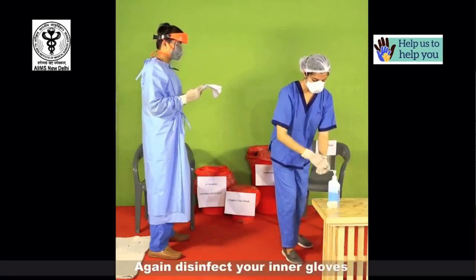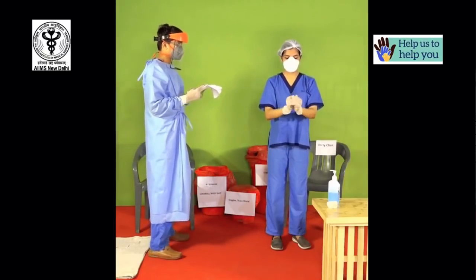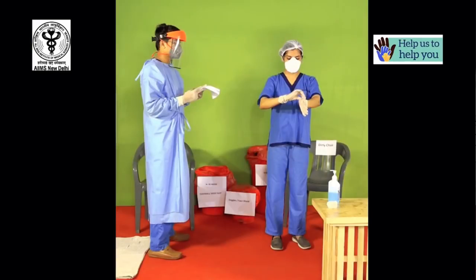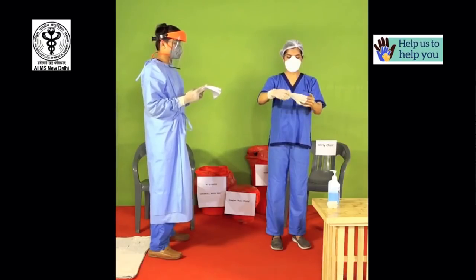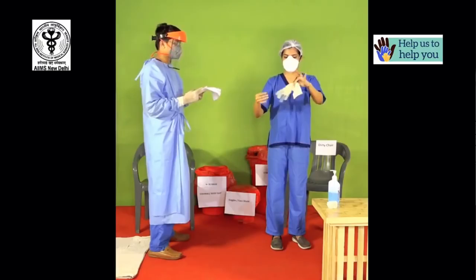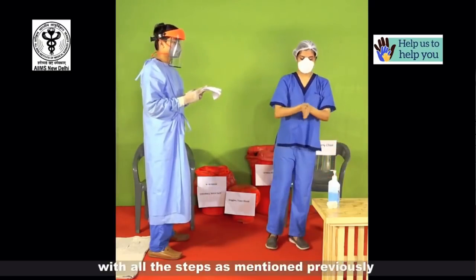Again disinfect your inner gloves. Carefully remove the inner pair of gloves as previously discussed. Now perform hand hygiene with all the steps as mentioned previously.